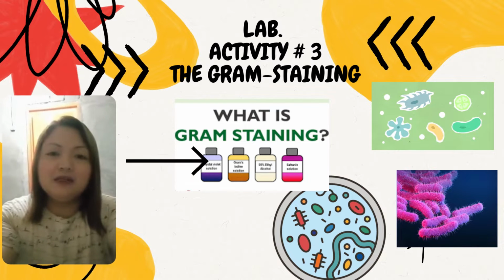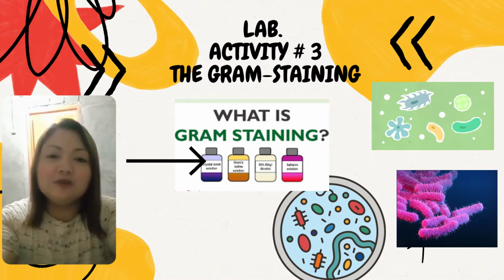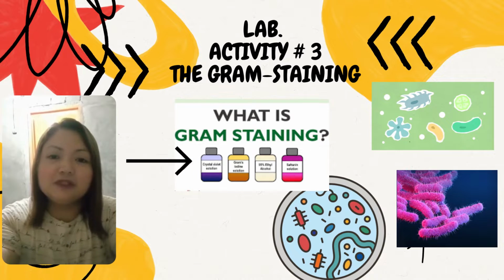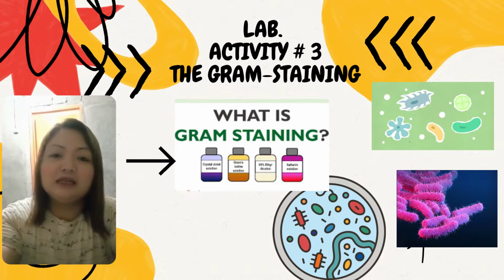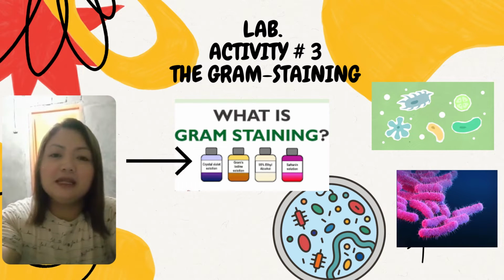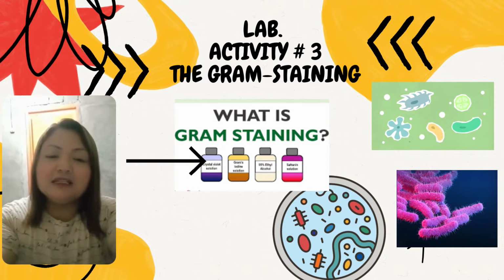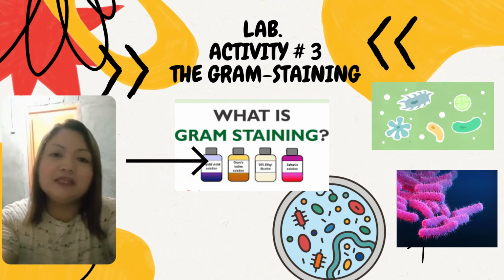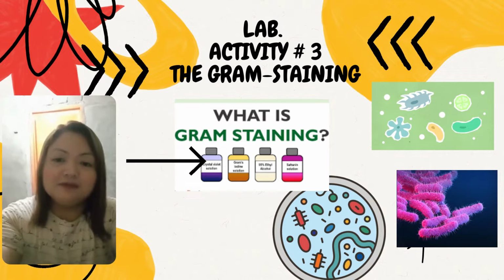So let's begin. What is gram staining? Gram staining is one of the most basic staining procedures done in the study of microorganisms. It is a differential stain that groups organisms into gram-positive and gram-negative organisms and can aid in the basic identification of organisms. It also demonstrates the basic shape of the organism being studied.